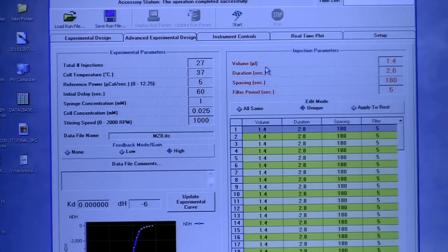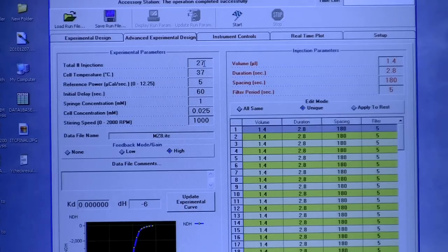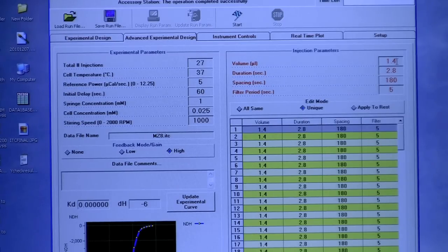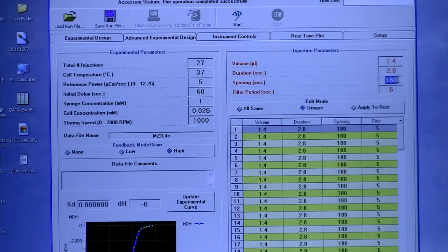One important parameter is volume per injection. The syringe contains 40 microlitres, so multiply the number of injections by the volume per injection and make sure it does not exceed 40 microlitres — otherwise you risk introducing bubbles. Generally keep injections at 1.2 to 1.4 microlitres. Spacing is typically 180 seconds (3 minutes), though some go up to 5 minutes depending on how fast or slow the equilibrium is.